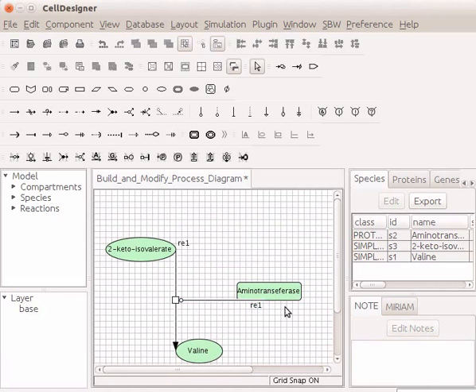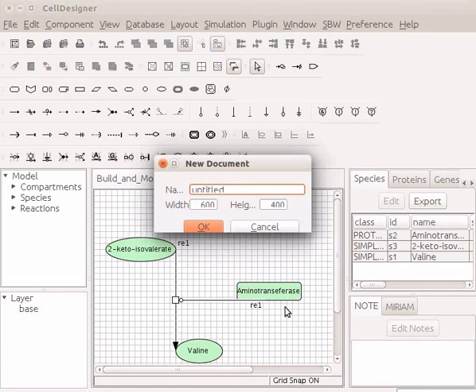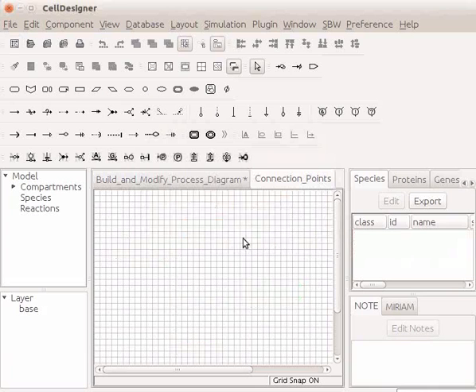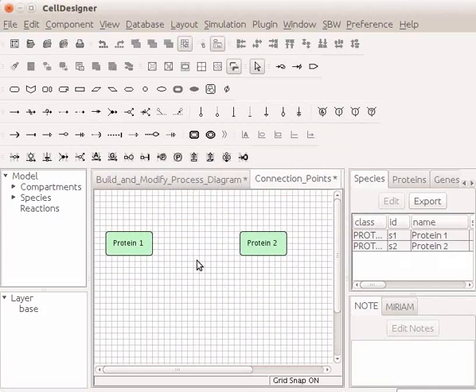Open a new window by pressing Ctrl-N. Name this file as Connection Points. Keep the default width and height and click on the OK button. On the draw area, draw two generic proteins and name them Protein1 and Protein2.